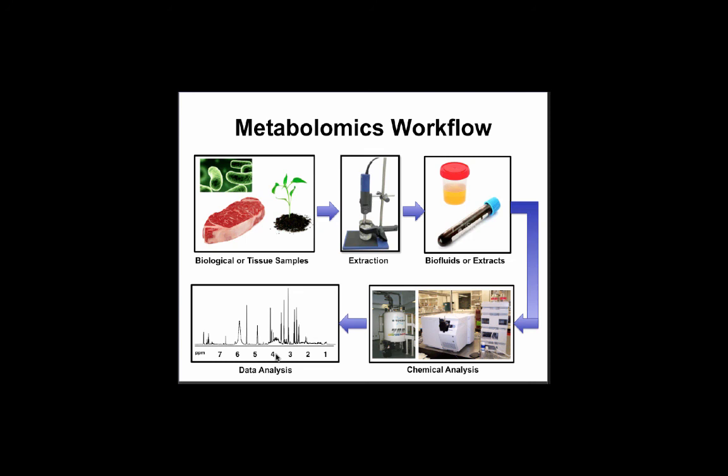Once you've got your fluids, then you can do the chemical analysis: chromatography, mass spectrometry, NMR spectroscopy, infrared. The big development in the last 10 years for metabolomics isn't really the chemical analysis. The technologies have been around for decades. It's that last step, taking a mixture and interpreting the components of that mixture. Up until recently, the whole point of analytical chemistry was to analyze and identify pure compounds. But in metabolomics, we're looking at mixtures, and in many cases, we don't make a whole lot of effort to separate things into pure compounds. So it's the data analysis component which has revolutionized metabolomics, this capacity to look at mixtures, quantify them, and deconvolute them. A lot of that's based on the development of spectral databases, new kinds of software, and analytical tools to parse out the spectra and their meaning.